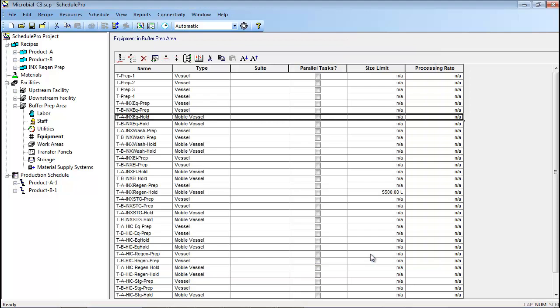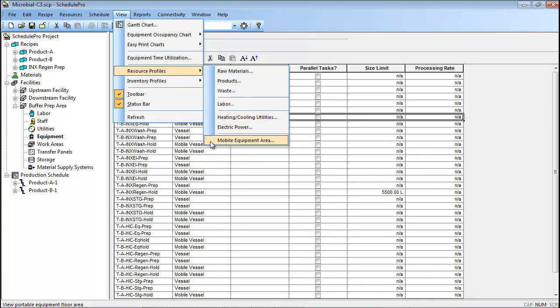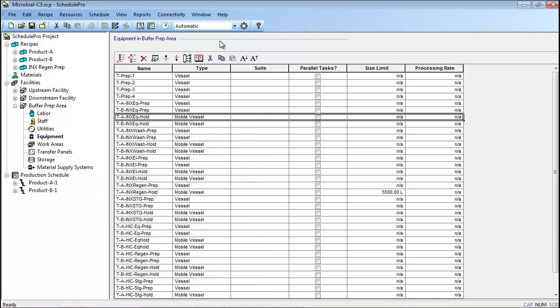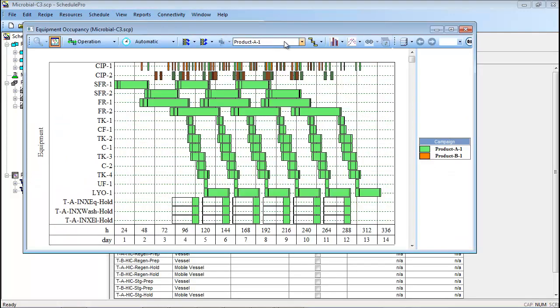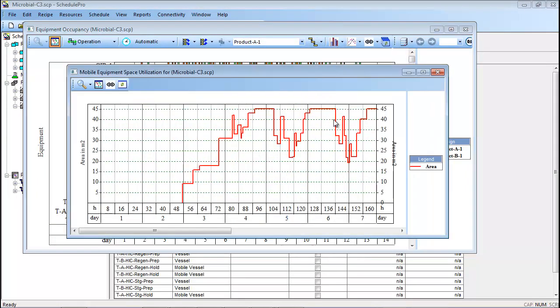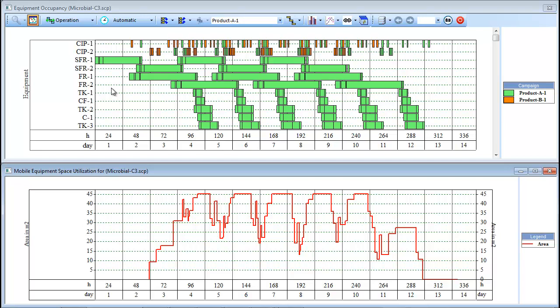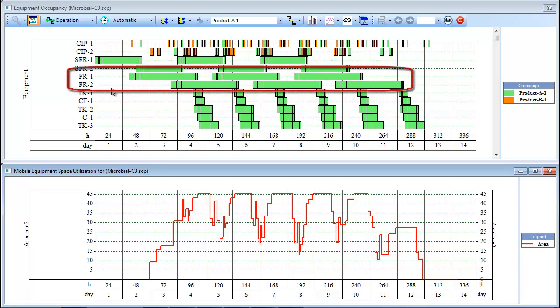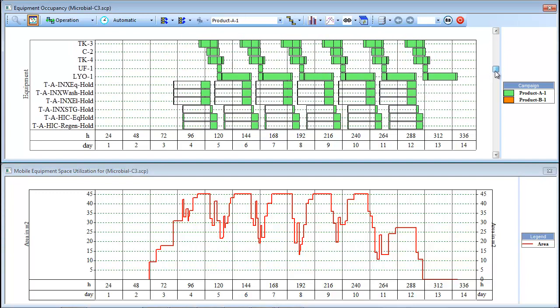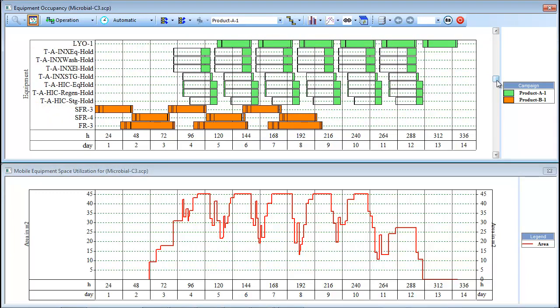After entering the new mobile equipment specifications, the total floor space required by these units during the course of a campaign may be tracked by choosing View, Resource Profiles, Mobile Equipment Area. This chart can also be generated directly from the EOC by clicking the Equipment Occupancy Chart button and selecting Mobile Equipment Area. Here you can see the Mobile Equipment Chart linked to the EOC for a 6-batch campaign of Product A and a 6-batch campaign of Product B. The EOC in this case shows the utilization of the production bioreactors as well as the utilization of the buffer hold tanks. The Mobile Equipment Area chart shows the total amount of open floor space that will be required within a staging area of the facility in order to support the main process.